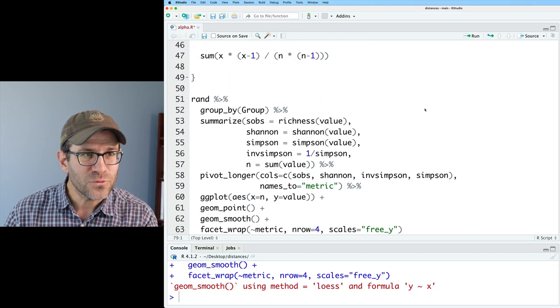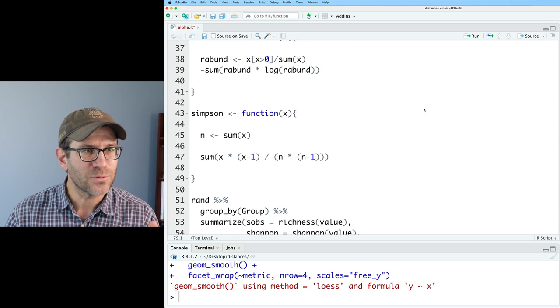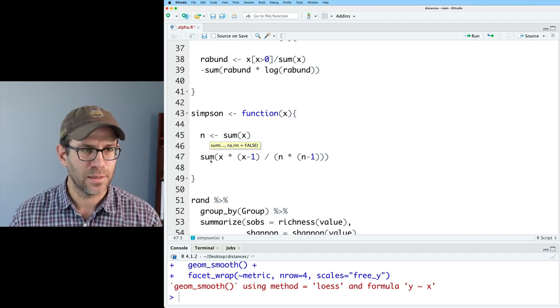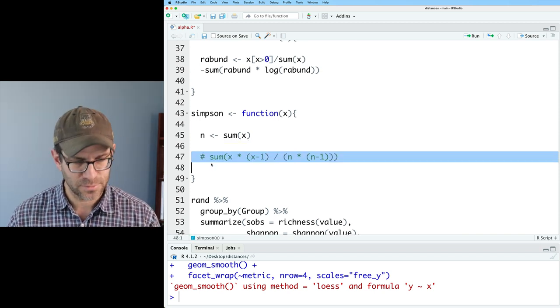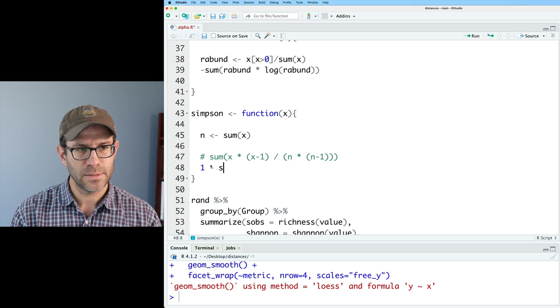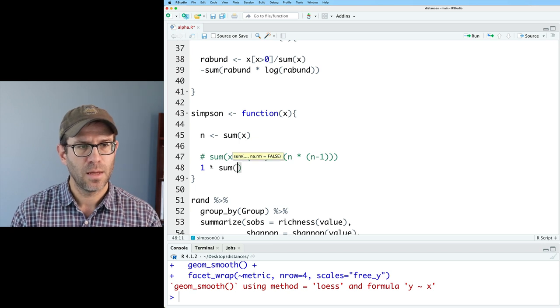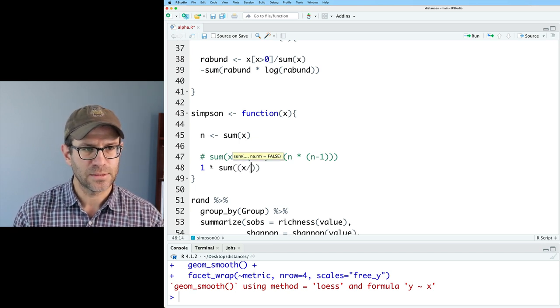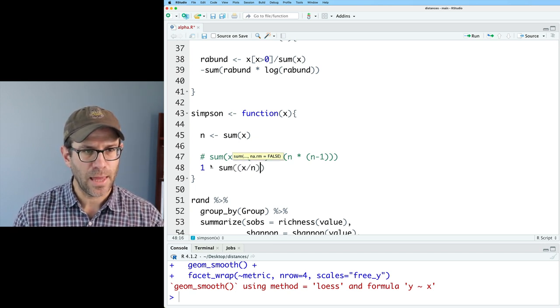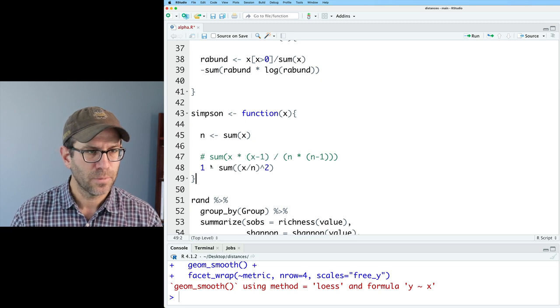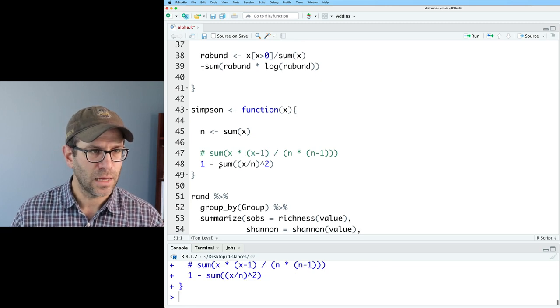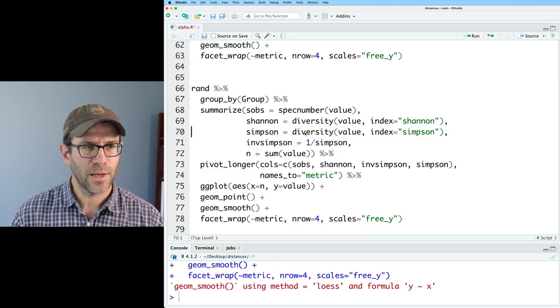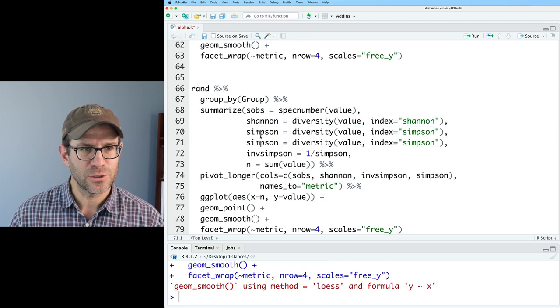So if we wanted to prove to ourselves that that was what was going on, in fact, I'll go ahead and comment out this my sum line. So I could do one minus the sum of x divided by n and all that squared. Reload that function. I could then bring in my version.